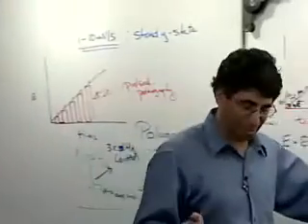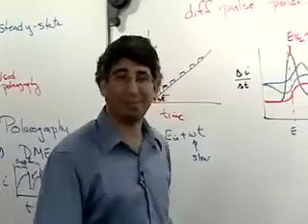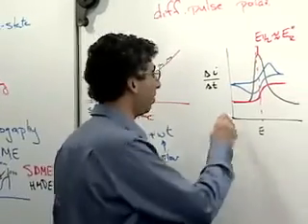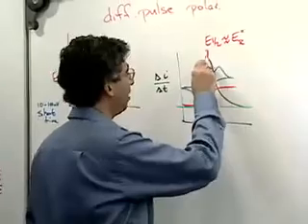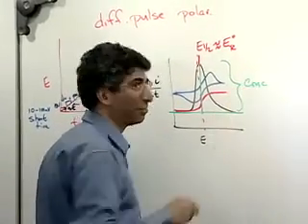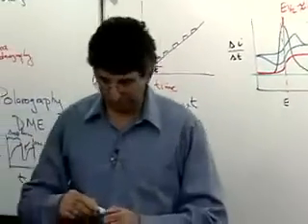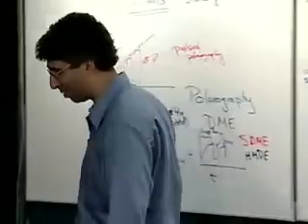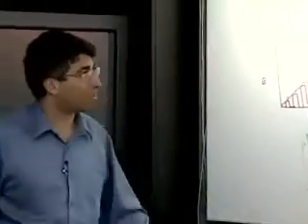And I guess it goes without saying, because I guess I didn't say it, but the amount of material that you have there, that's typically what this is used for, right? Measure that. You want to correlate some height here with a concentration. That's the primary use for this, for pure analytical chemistry. You know, I have X millimoles or micromoles or whatever of whatever around.